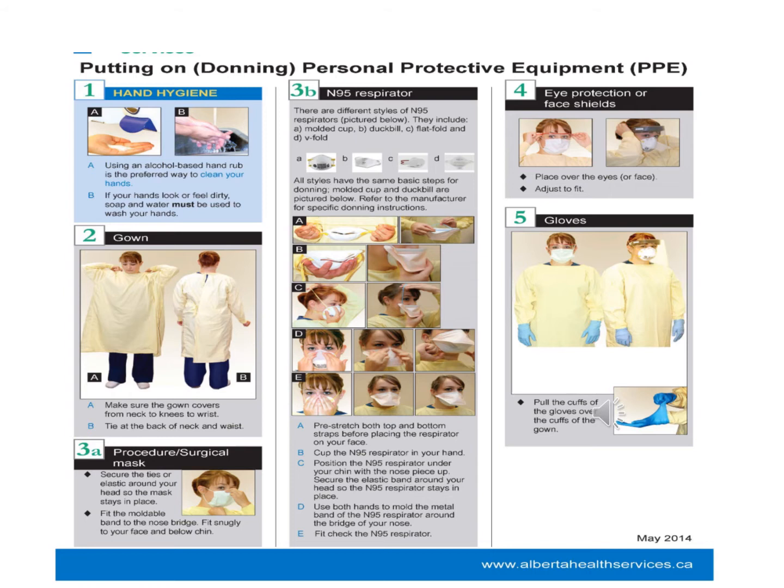Each lab has gowns, and there is a special procedure for wearing them. For example, make sure the gown covers you from neck to knees, and of course down to the wrist, and tie the gown at the back of your neck as well as your waist. And third, if needed, you wear the surgical mask.